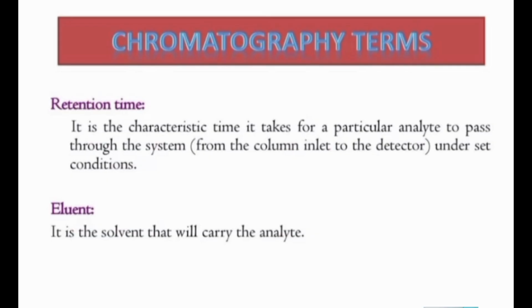Next, chromatography terms. There are many chromatographic terms. We discuss retention time, eluent, and retardation factor. First is retention time. Retention time is the characteristic time it takes for a particular analyte to pass through the system, from the column inlet to the detector under set conditions.